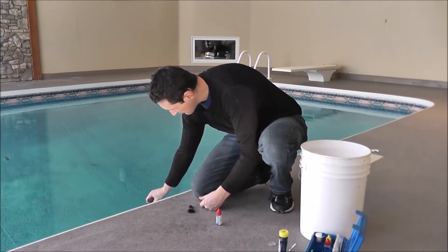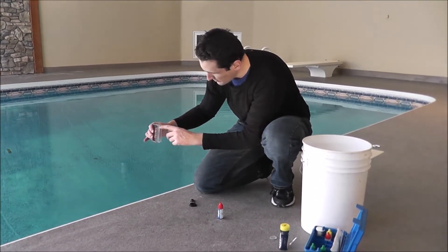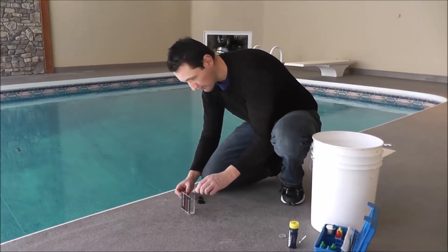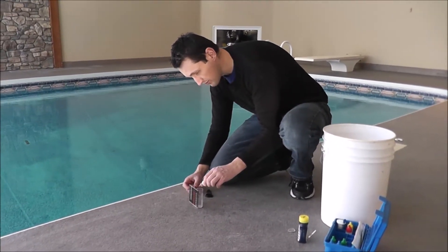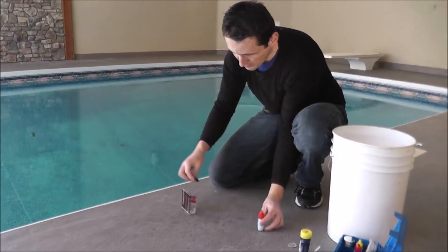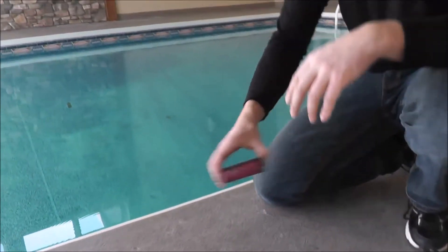The second step is to fill it up to the 44mm line and put 5 drops of Phenol Red in: 1, 2, 3, 4, 5. Put the cap on and shake it up until it's thoroughly mixed.